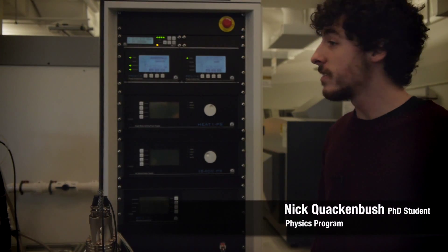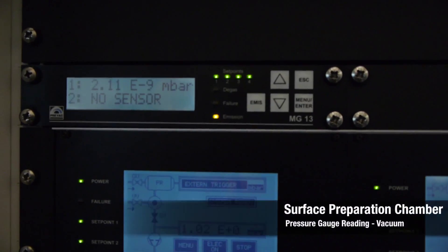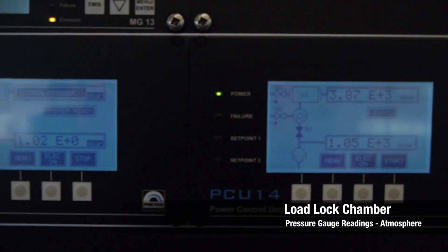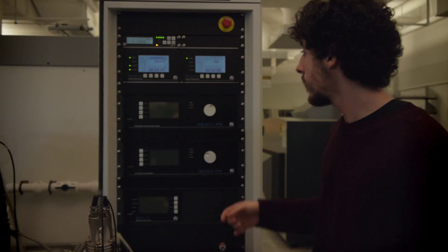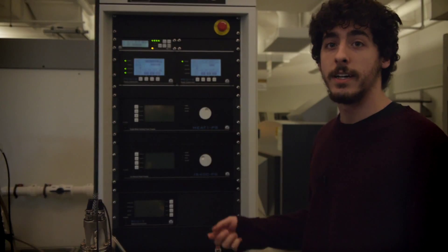Hi, I'm Nick Weichenbush. I'm a PhD student here at Binghamton, and this is our control unit for our vacuum chamber. Here we see the pressure for our preparation chamber, and this controls the pressure and everything. This control unit also shows the pressure in our load lock. What we're going to do now is start the rotary pump to pump it down to a rough vacuum, and then the turbo is going to kick on after.